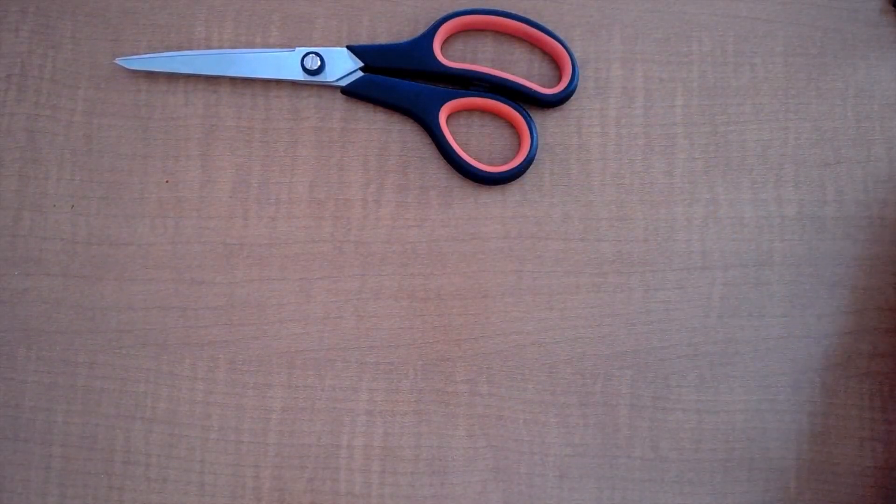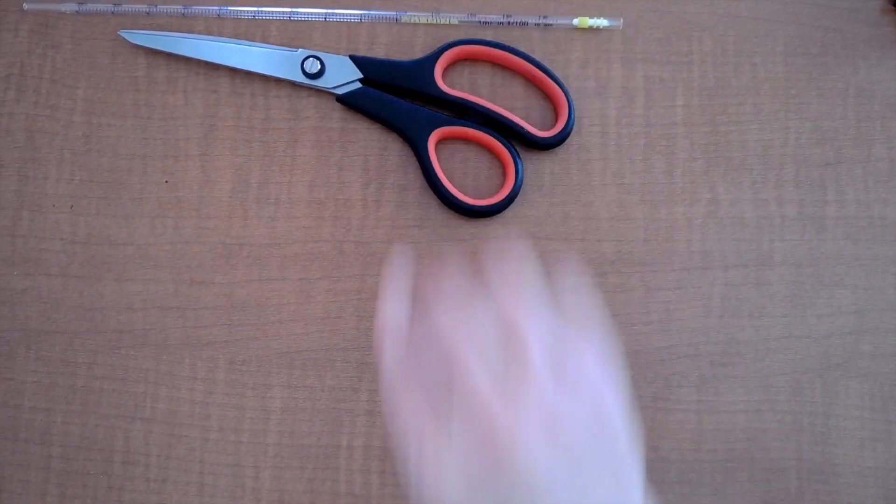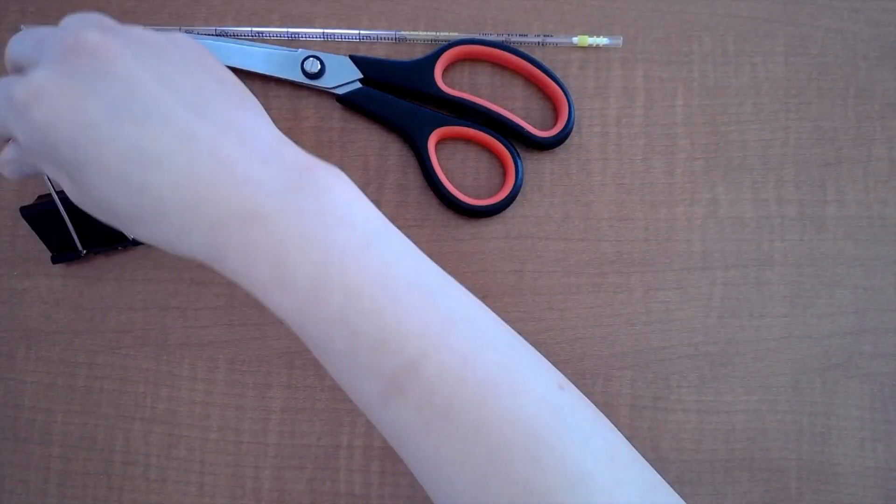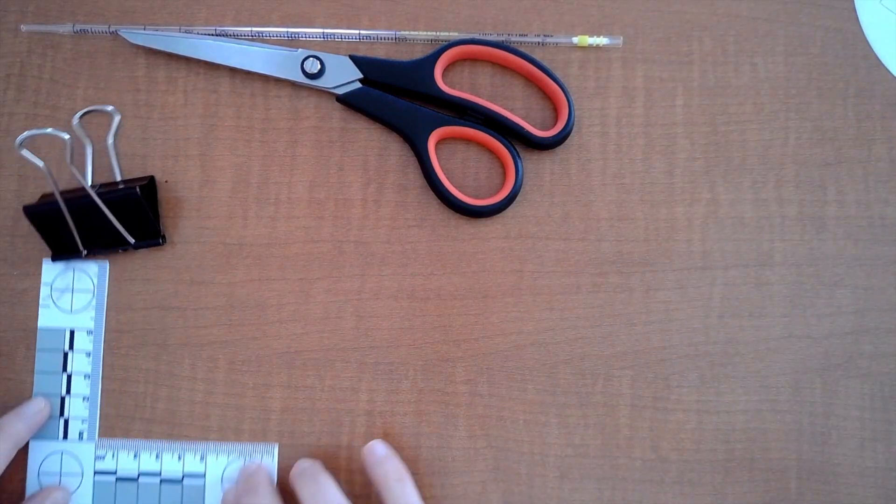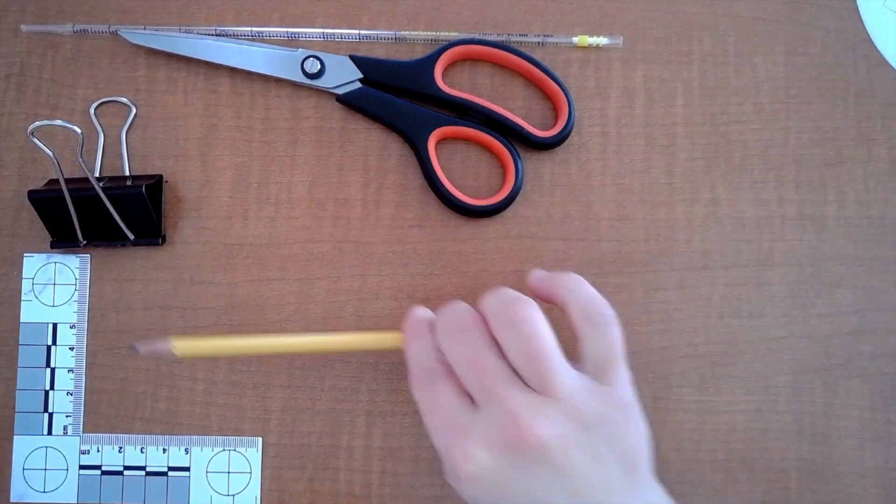We will need some scissors, a serological pipette, a large binder clip, your L-shaped ruler, and a pencil.